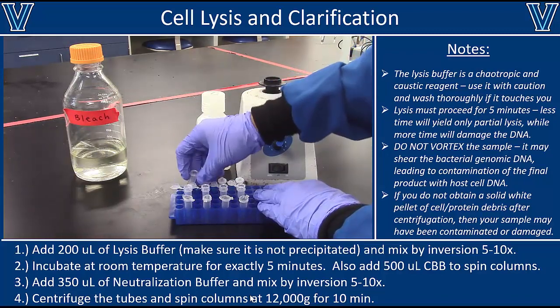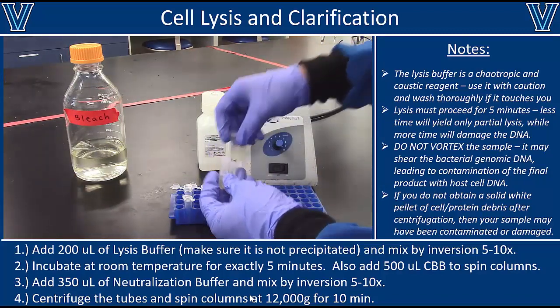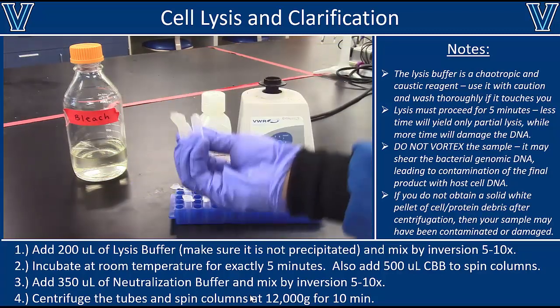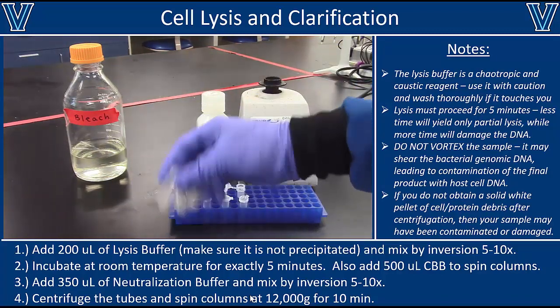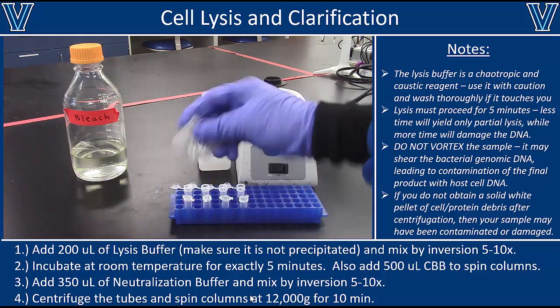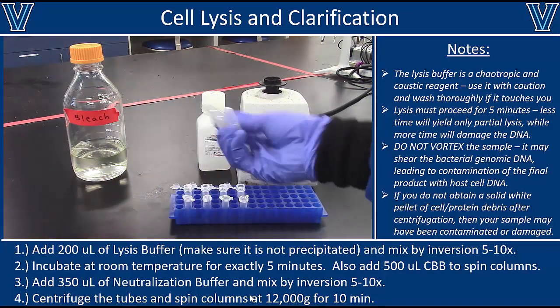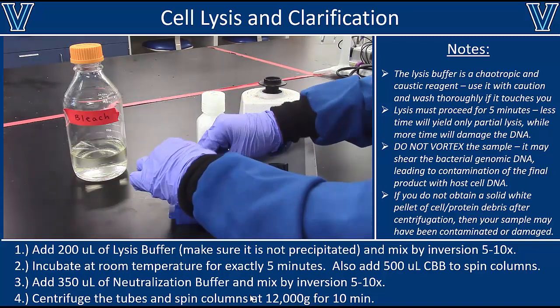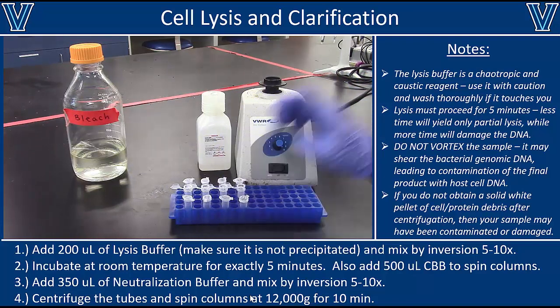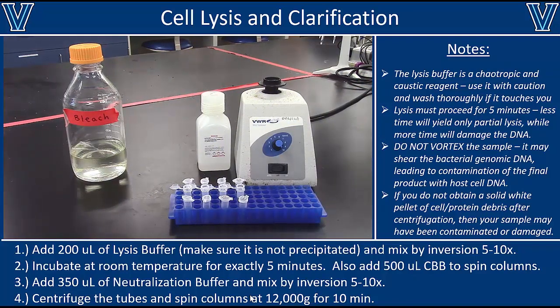Okay, so once I've added that lysis buffer, the clock starts ticking. I need to first mix these tubes by inversion until they're homogeneous. Then I let them incubate at room temperature for 5 minutes. Do not vortex these tubes to mix them. It will shear the genomic DNA and your final product will be contaminated with genomic DNA.